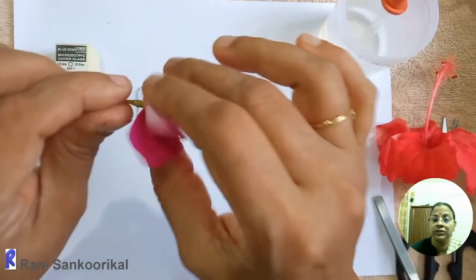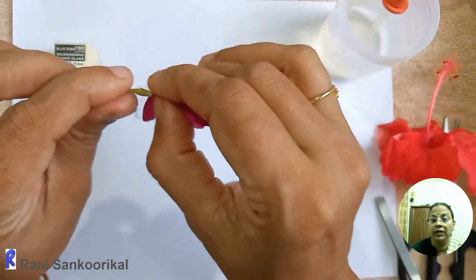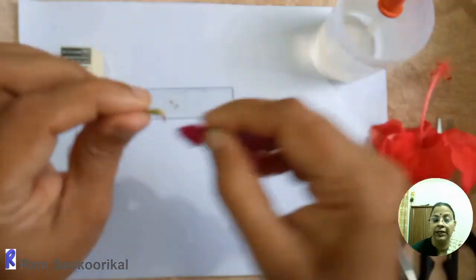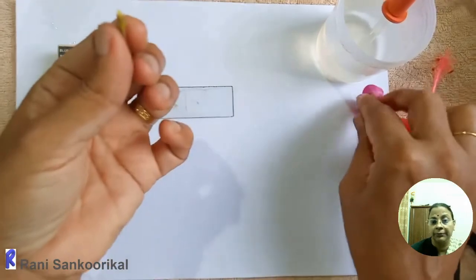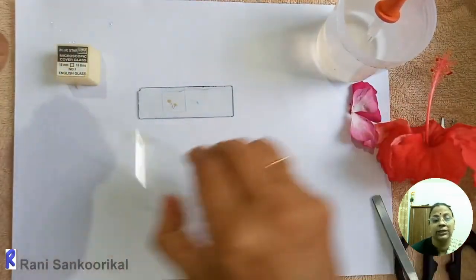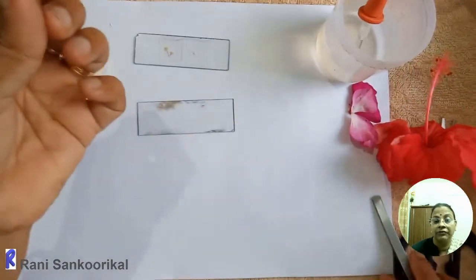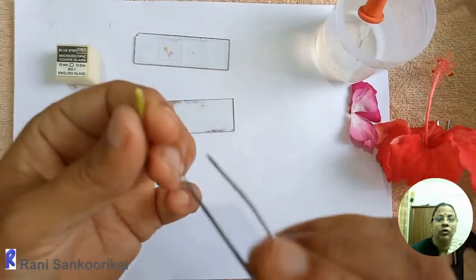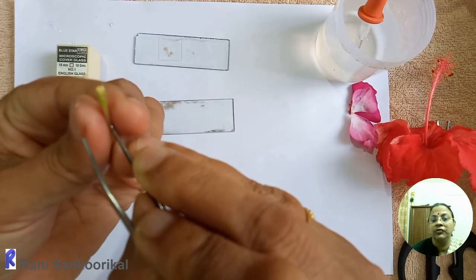The same procedure itself I am here showing with the vinca flower, periwinkle we'll say, or Shavannari in Malayalam. So how can you extract the pollen from it, because it is not visible externally. So first you have to pluck off the petals, the external part, and make a slit on the tube of the corolla.